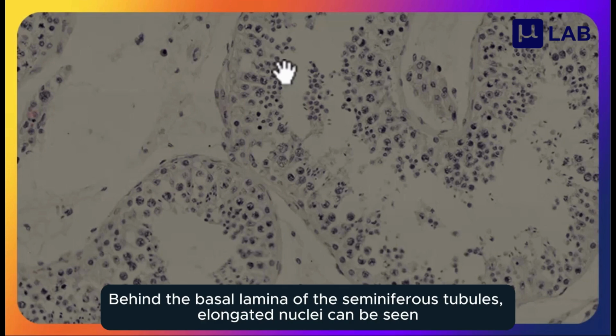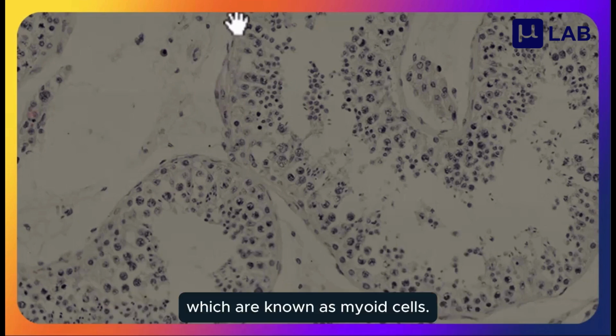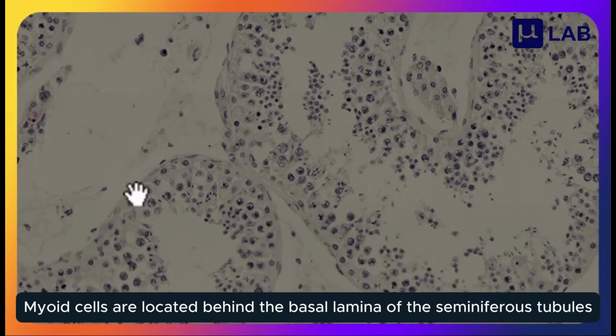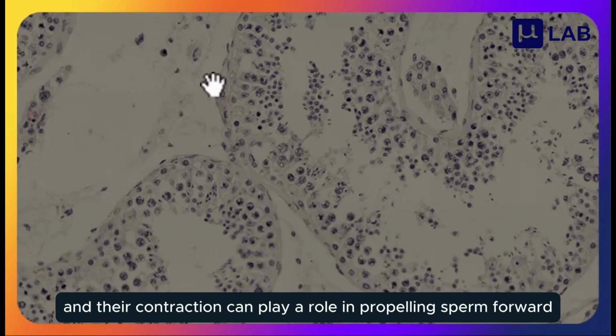Behind the basal lamina of the seminiferous tubules, elongated nuclei can be seen, which are known as myoid cells. These elongated nuclei that you see here are identified as myoid cells. Myoid cells are located behind the basal lamina of the seminiferous tubules, and their contraction can play a role in propelling sperm forward.